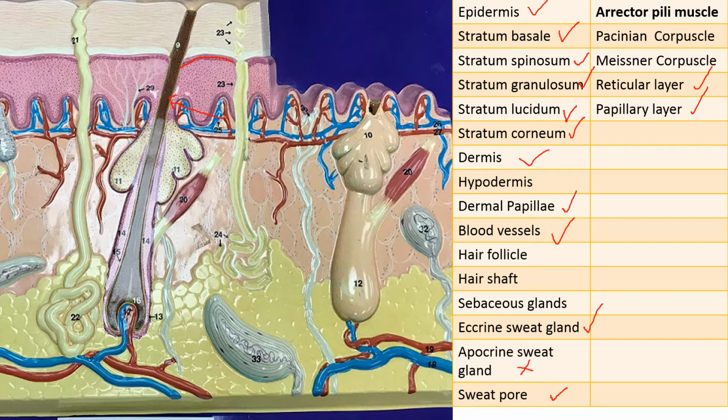While I mentioned follicles, this is a hair follicle. It's responsible for producing hairs. So the brown that you see here, that's the shaft of a hair that's growing in this particular hair follicle. Surrounding the hair follicle, you have another gland. This is called a sebaceous gland. It secretes an oily substance called sebum, and that sebum lubricates the hair.